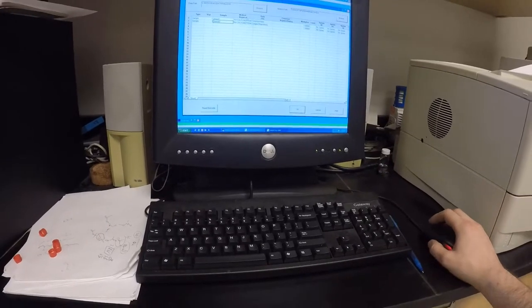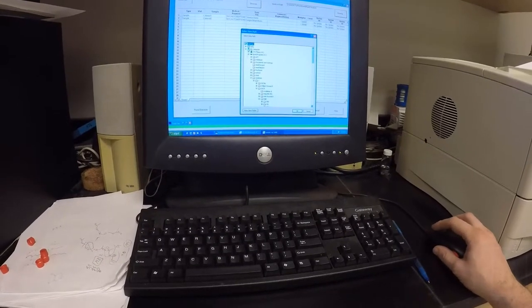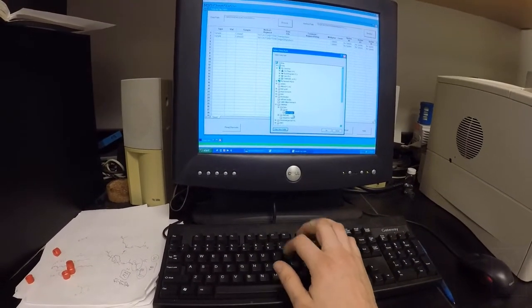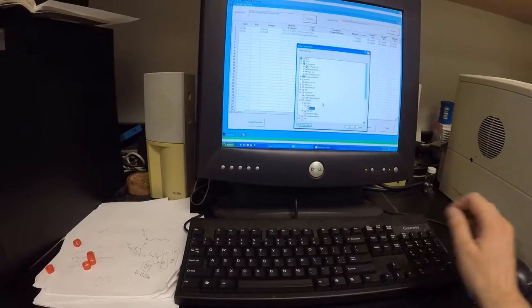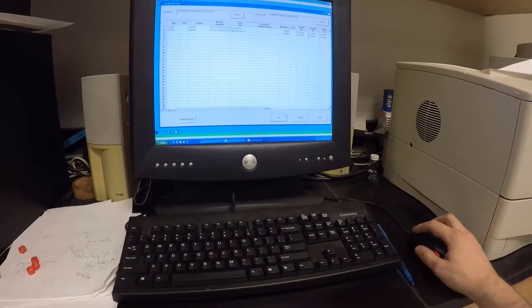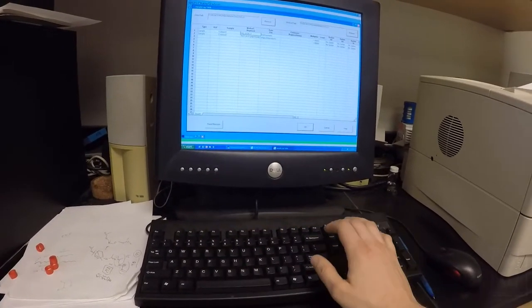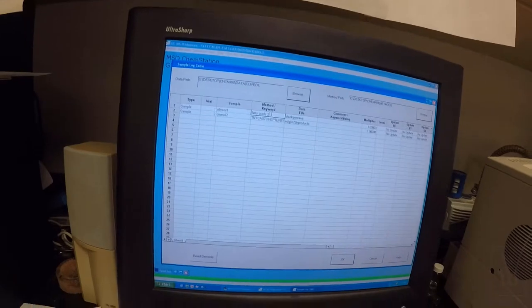We want to say where we're going to save these though. So I'm going to go to my data path. Again on the desktop, under that CHEM 408, find that down here, we have a data folder. I'm going to make a new folder in here, and I'm just going to call that olive oil. I can put it wherever I want, just put it somewhere you can remember. The method path is in 408 methods, and we want to make sure that it's fatty acids 2. Whatever this thing is right here needs to be here: fatty acids 2.m, just fatty acids 2.